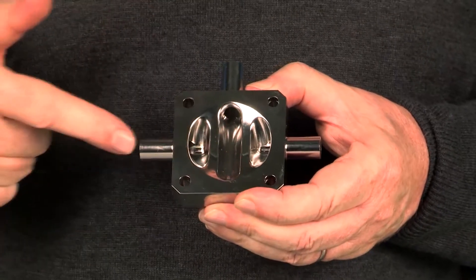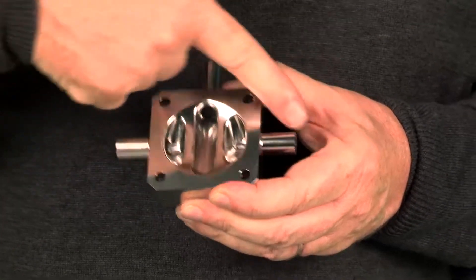We can have flow in this direction or we can have flow in this direction, and all of a sudden you have a three-way valve instead of a conventional two-way valve.